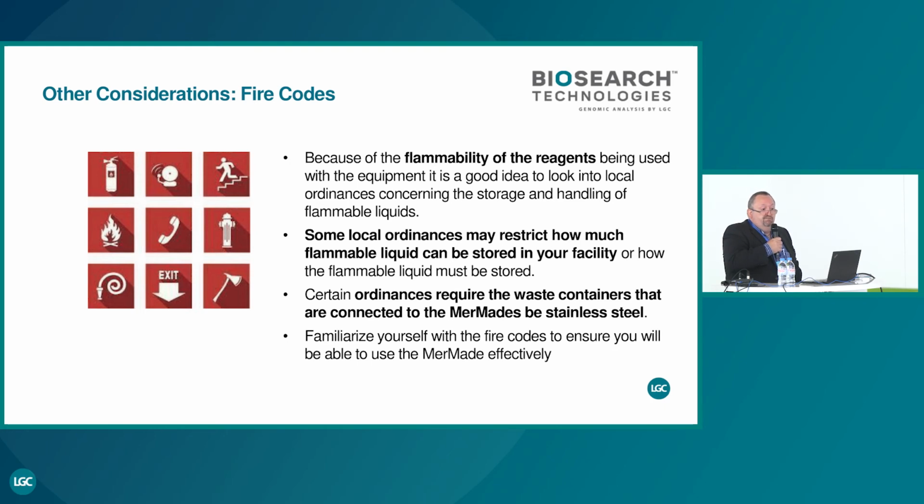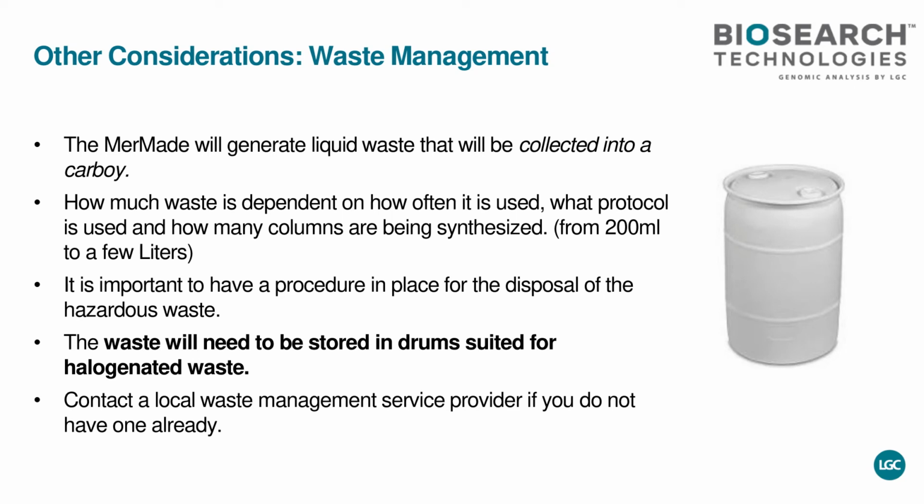Some local ordinance may restrict how much flammable liquid you can use. I cannot answer you, but it's important you check it. And you also have to check with the fire department in your area. The same for waste management. Don't forget we have chlorinated reagent in the waste, so you have to use waste resistant to this kind of reagent, and the halogenated waste, and also the volume.